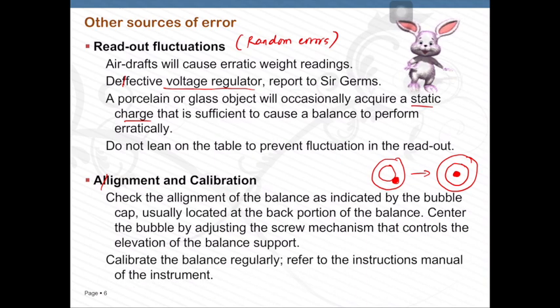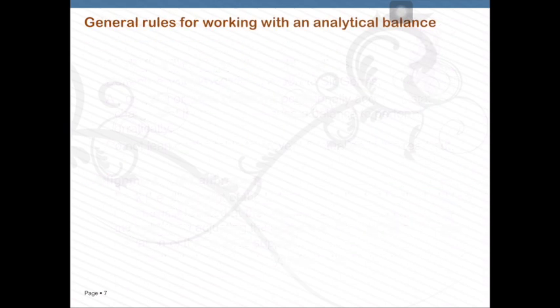Finally, calibrate the balance regularly. Refer to the instruction manual of the instrument. So when you use the analytical balance, it will automatically calibrate itself. So no need to worry about this.